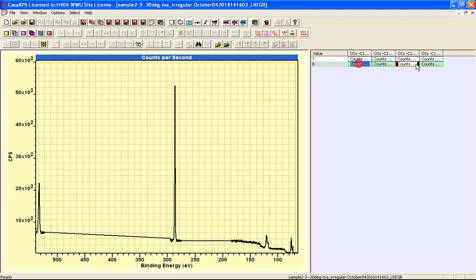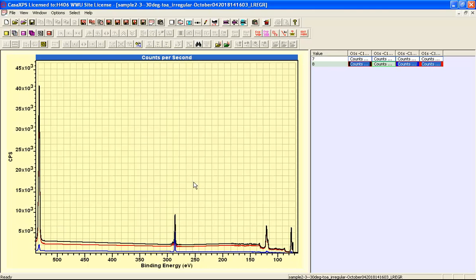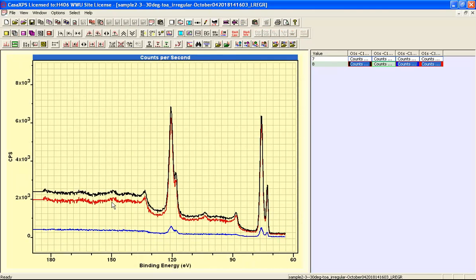So the interpretation of this decomposition is that we have a surface layer of aluminium oxide that is on top of a carbon layer that is burying another aluminium oxide layer.